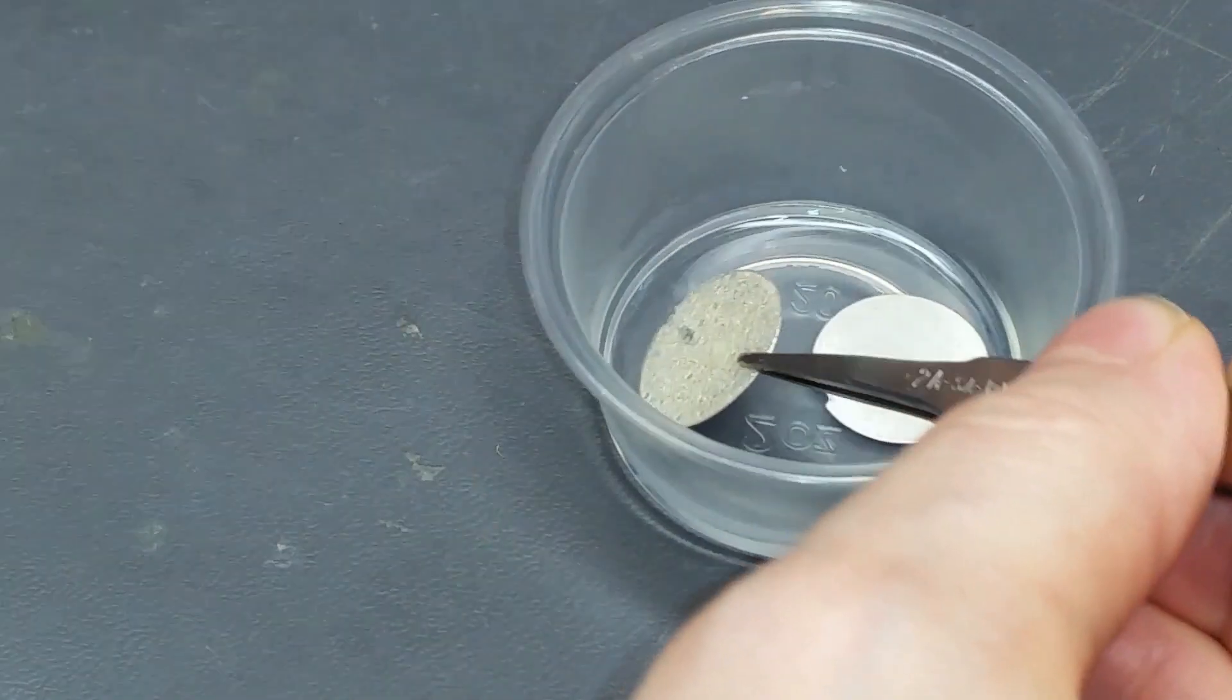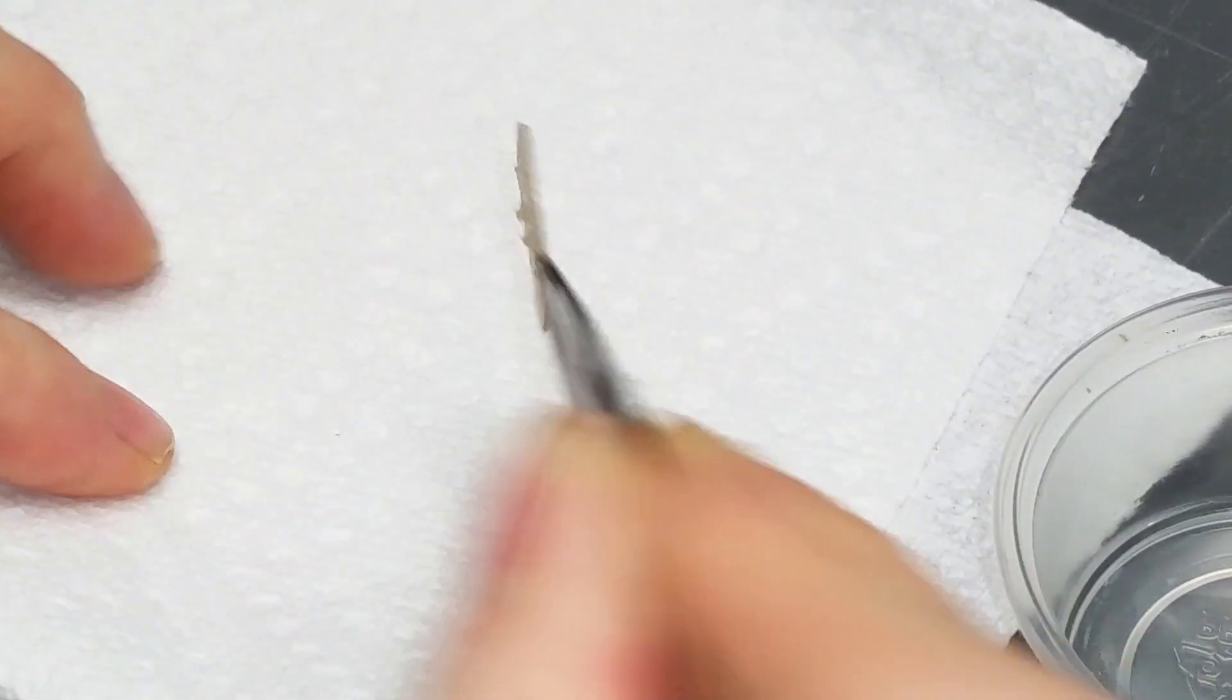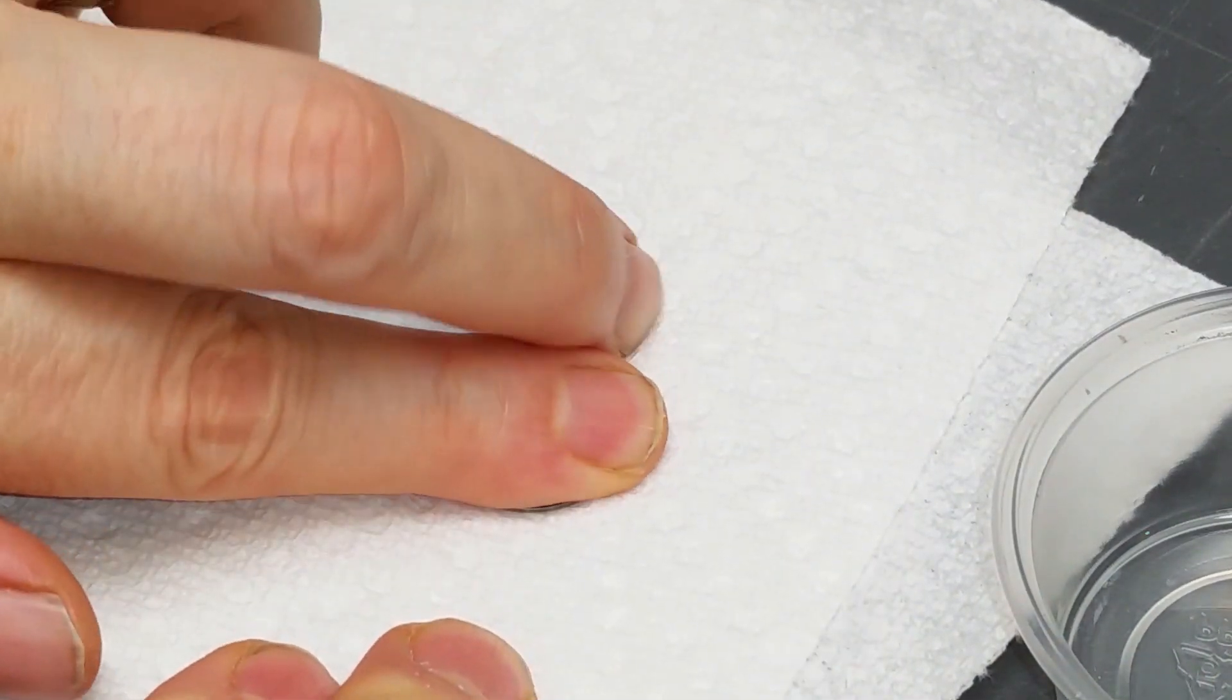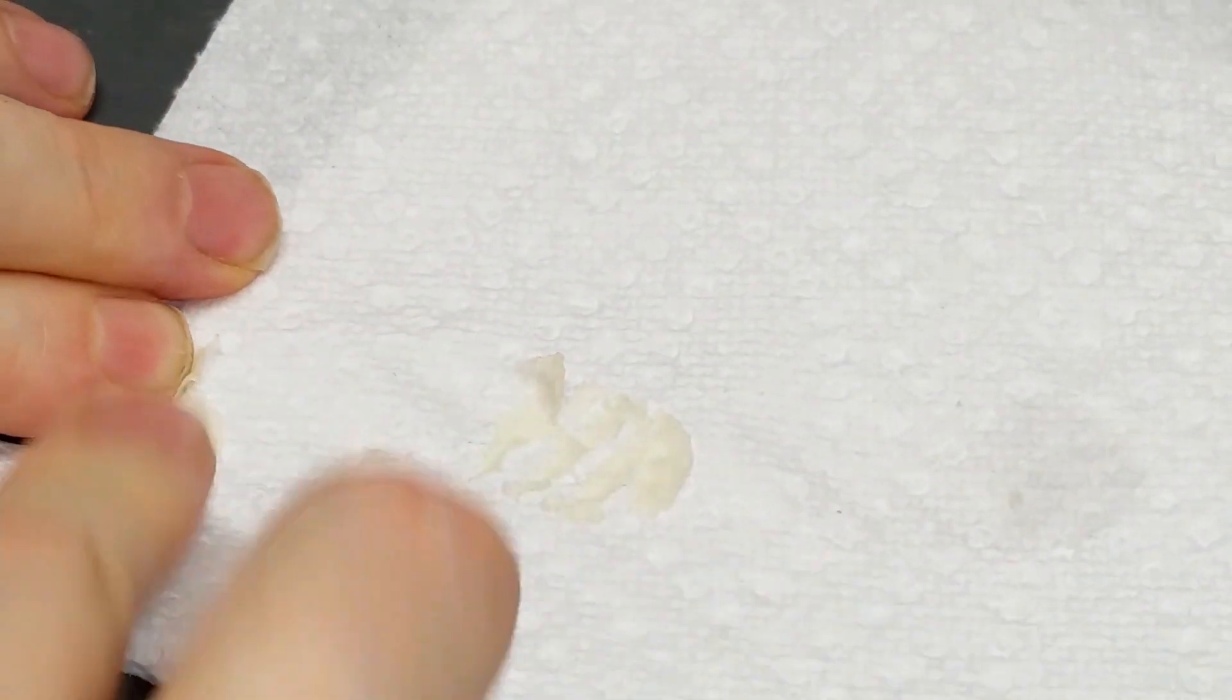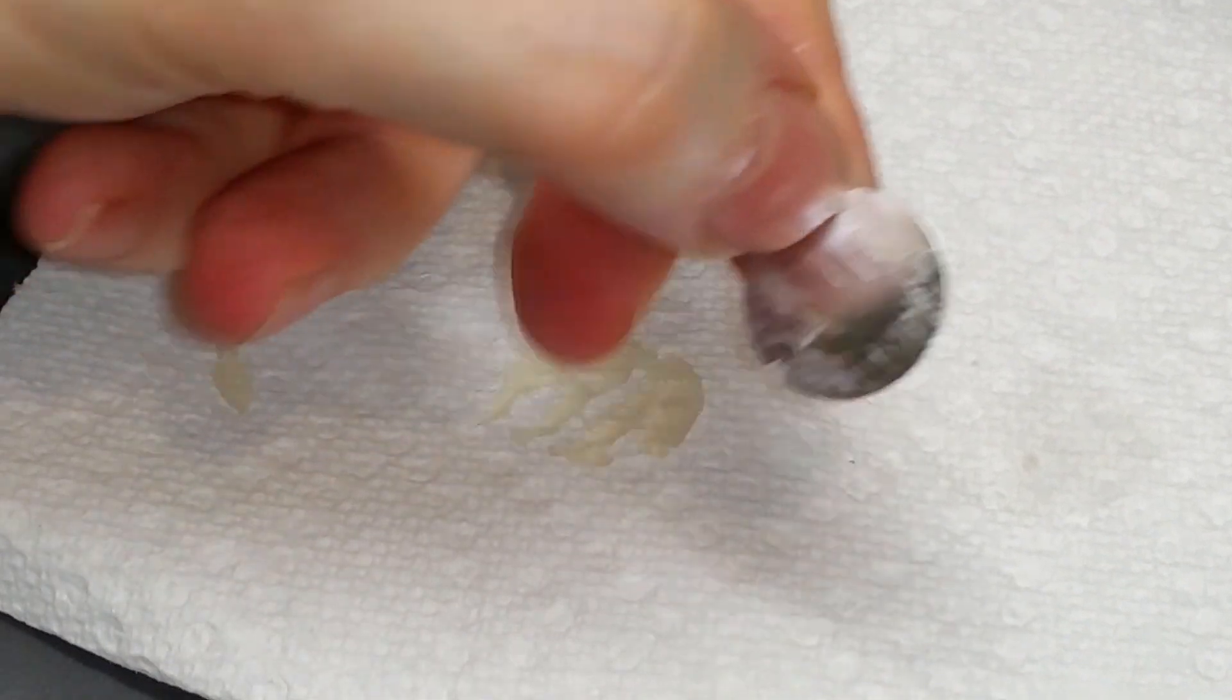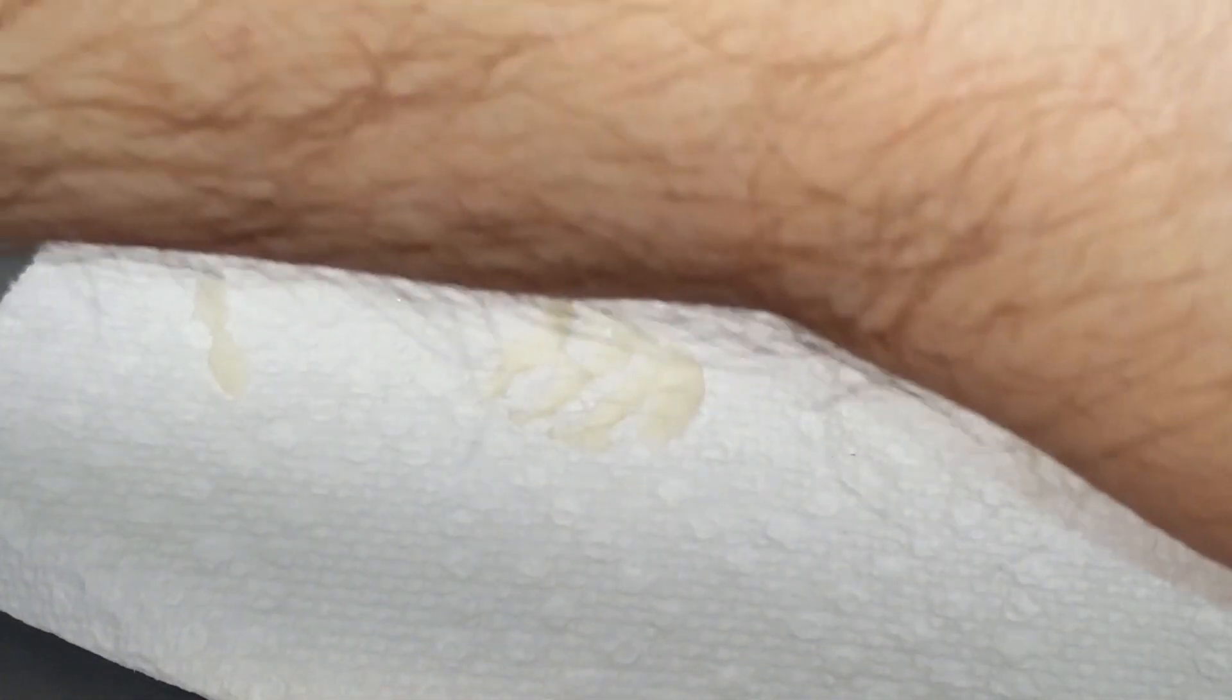I'm going to reach in and take out one of these and just put the adhesive down on a paper towel. As you can see, the old adhesive is kind of peeling off of it. It's still got a little bit in there. As you can see, there's still a little residue on there, so I'll put that back in there and we'll hit it again.